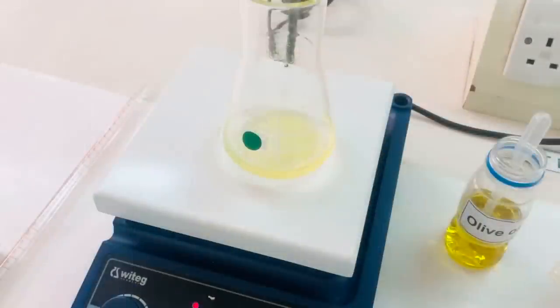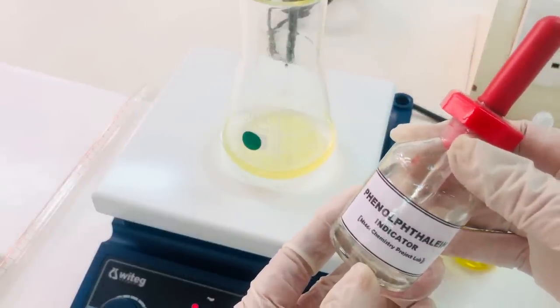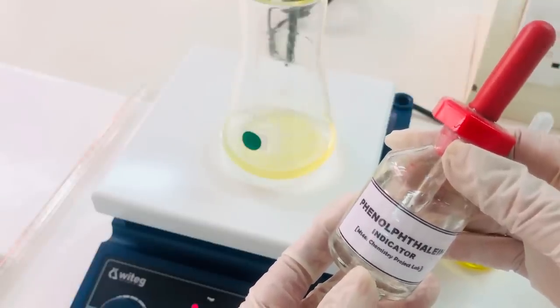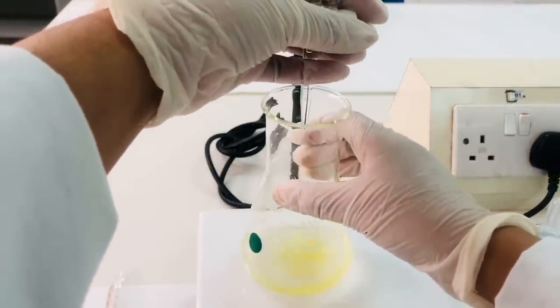As you can see, we have placed the conical flask on the hot plate, and now we are going to add phenolphthalein indicator to it. Around 1 to 2 ml of phenolphthalein indicator will be added to this conical flask. Swirl the mixture and start the titration.